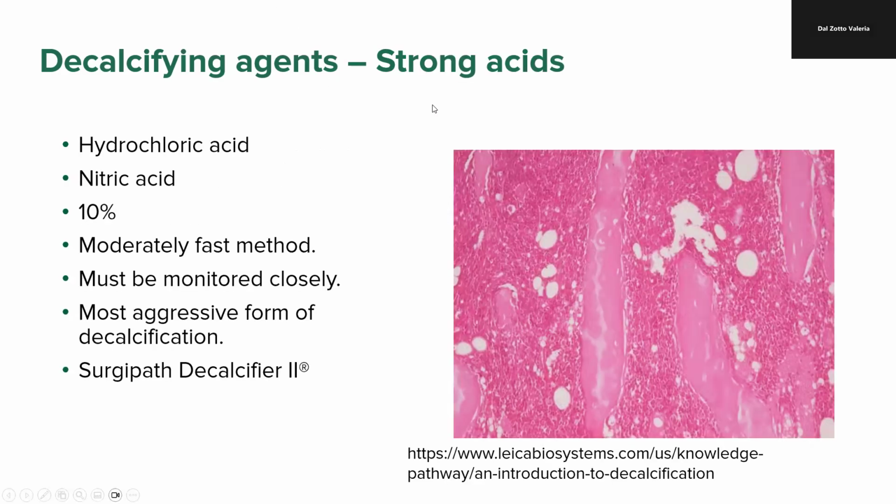The strong acids are basically hydrochloric acid or a combination of hydrochloric acid at 10% and nitric acid. These are, as the name implies, strong acids. That means that, if you remember from organic chemistry, strong acids are completely dissociated in aqueous solution.